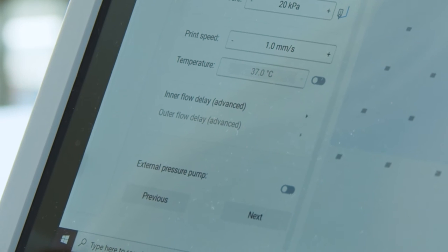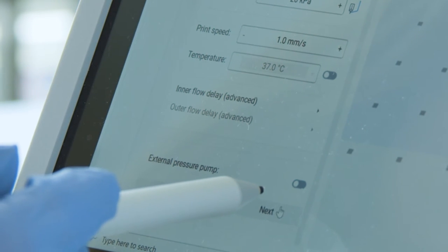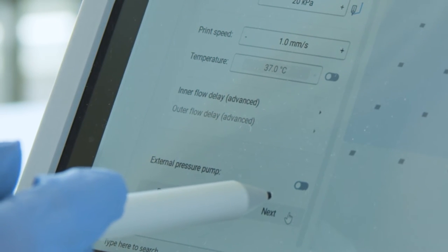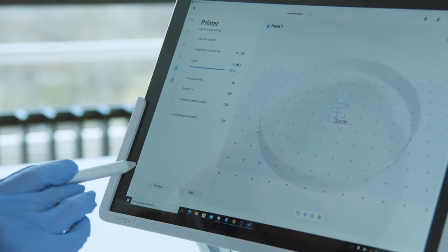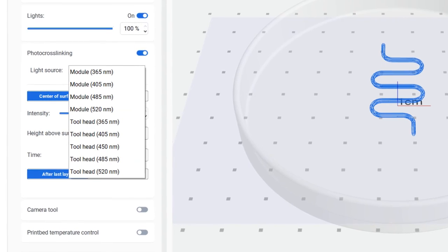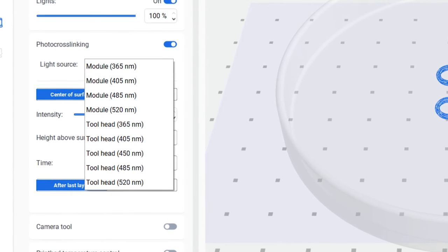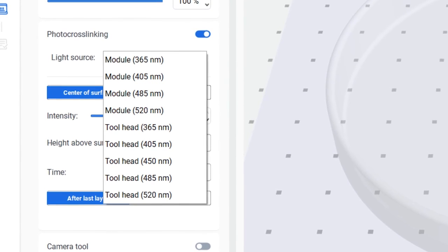There is also an option for an external pressure pump. The Bio-X6 already covers pressure up to 200 kilopascal for each printhead, and if you need higher pressure for extrusion you can assemble an external pressure pump up to 700 kilopascal. If you are using photocrosslinkable bioinks, the Bio-X6 is equipped with four built-in photocuring modules allowing photocrosslinking at different wavelengths including 365, 405, 450, 485, and 520 nanometers.